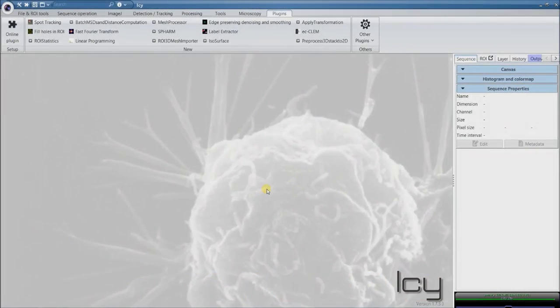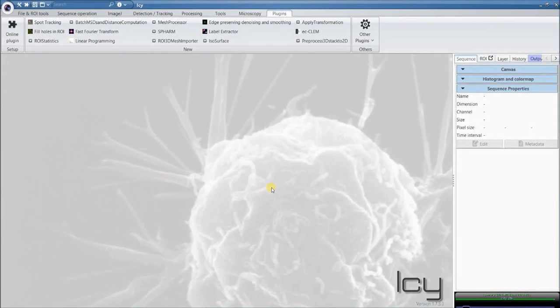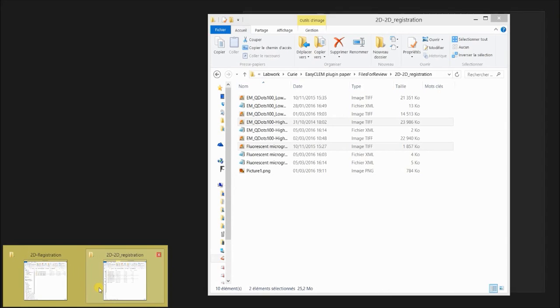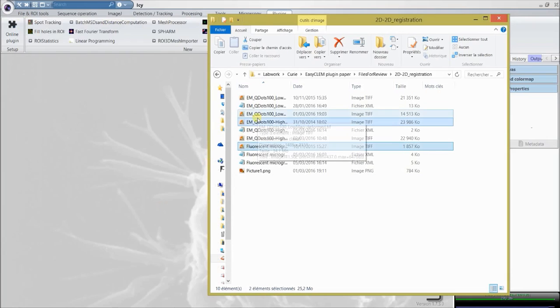In this video, we are going to look at how we do alignment of images from 2D fluorescence micrographs onto 2D electron micrographs. First of all, open the sections of interest.